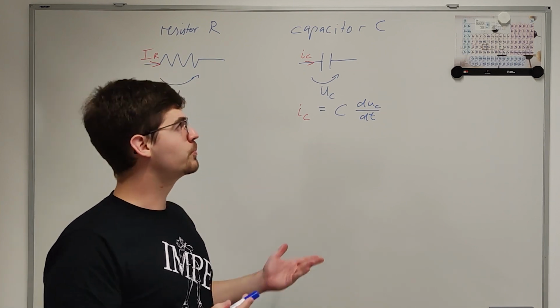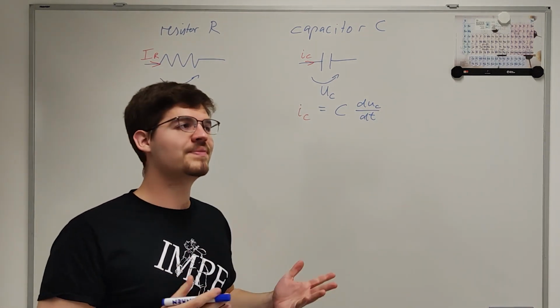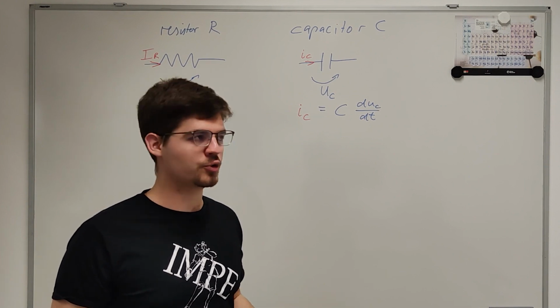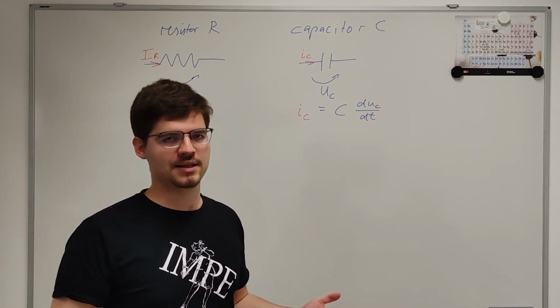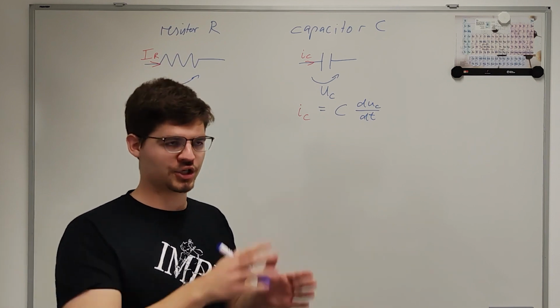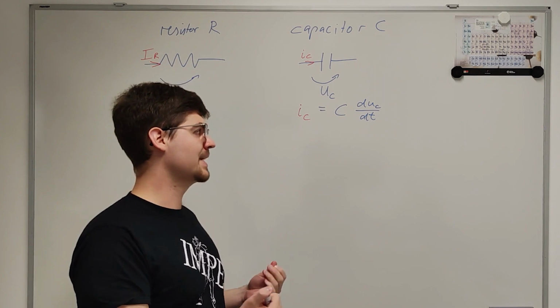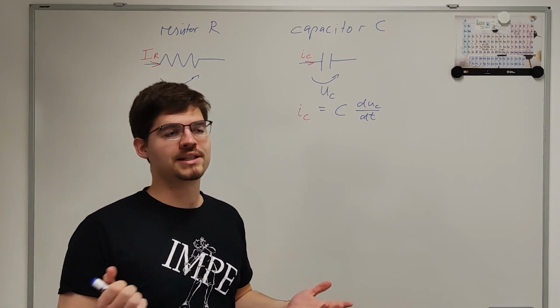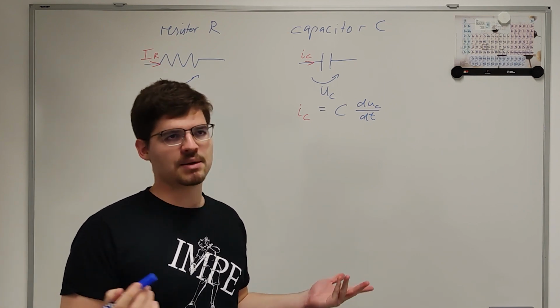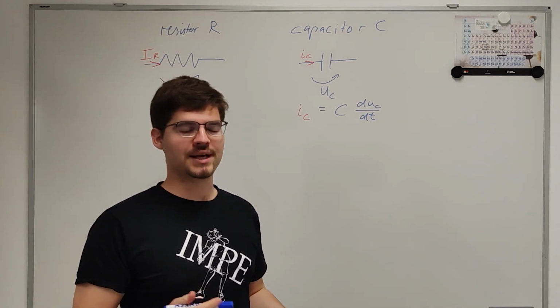And so if we want to probe similar systems that have a similar response, then it might be convenient for us to use a voltage excitation that produces a current that actually persists and is not just transient. And for this, the most common excitation waveform is the alternating voltage, sometimes referred to as AC for alternating current, and it's basically a sinusoidal excitation.